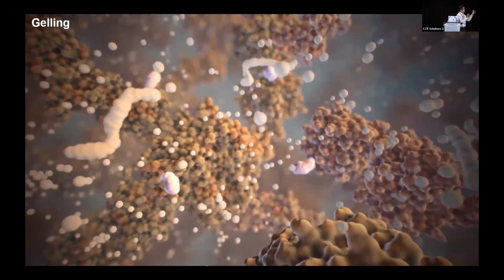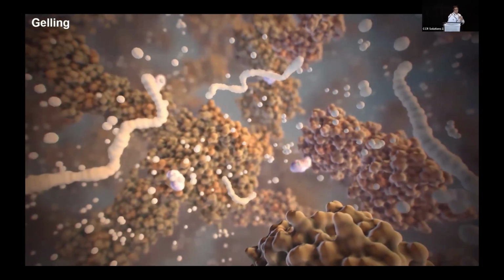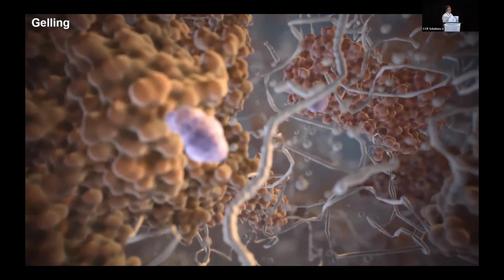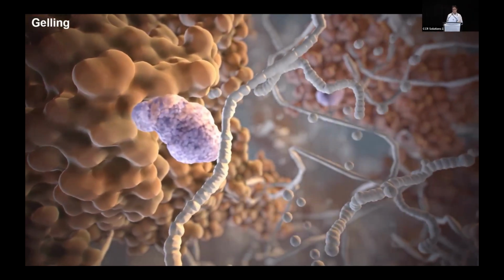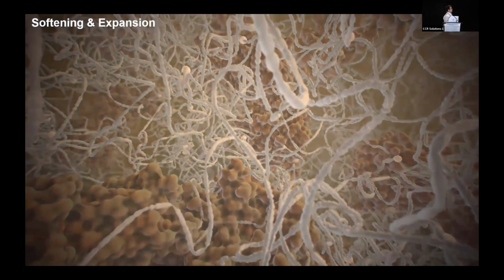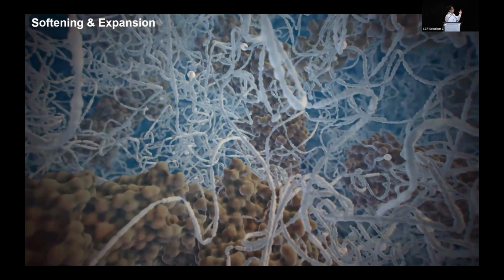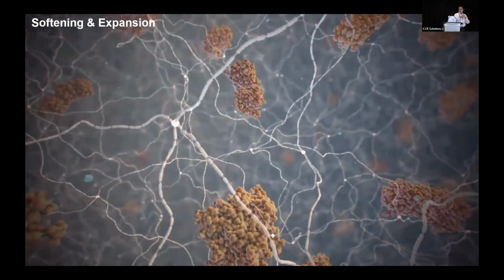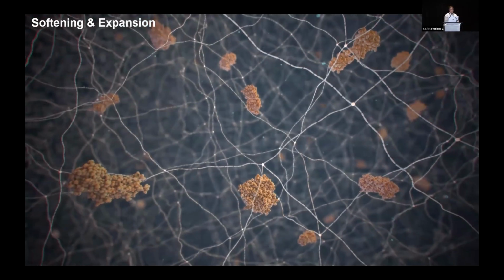You can see countless of these monomer molecules. They form this polymer chain, and during this process, the modified biomolecules will actually covalently link to the gigantic hydrogel network within. And after that, you have to go through this so-called softening process. Basically, you can apply enzyme to specifically cleave off the proteins, or you can try the heat denaturation approach to loosen up the tissue so that the hydrogel will be able to expand in the water and then separate all these proteins or other biomolecules.